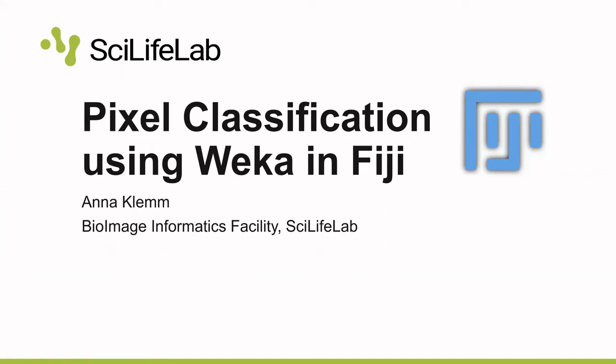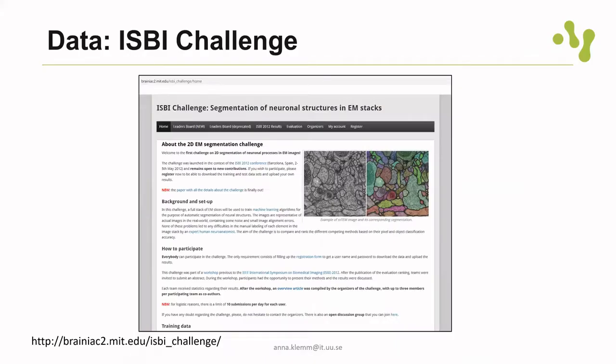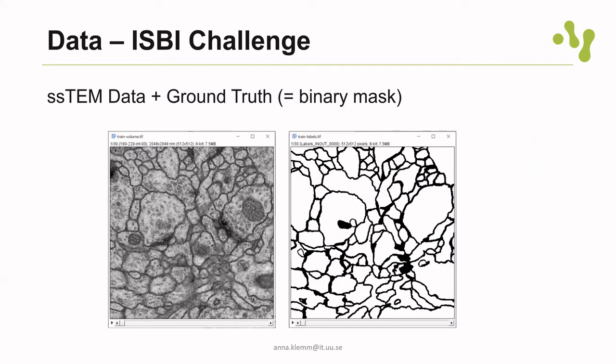This is a quick demonstration of how to do pixel classification in Fiji. As in the Elastix video that is also on this channel, we are using as an example the ISBI challenge data for 2012. The data is a TEM dataset where we want to segment the membranes but exclude mitochondria or mitochondrial membranes and the background.